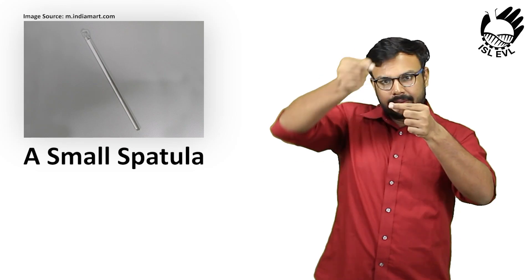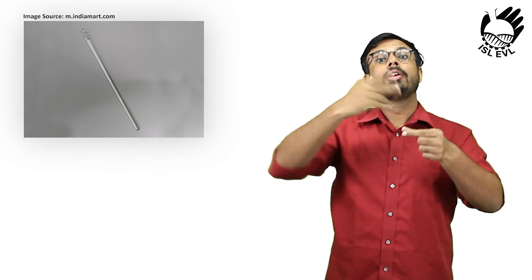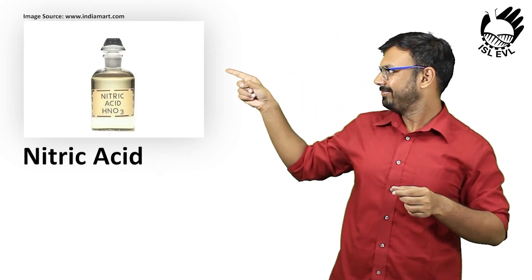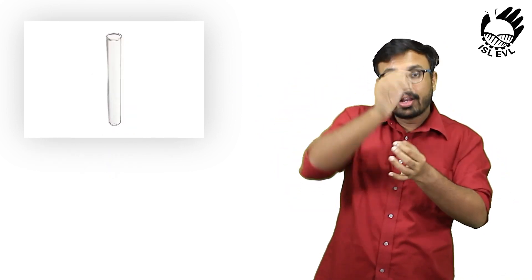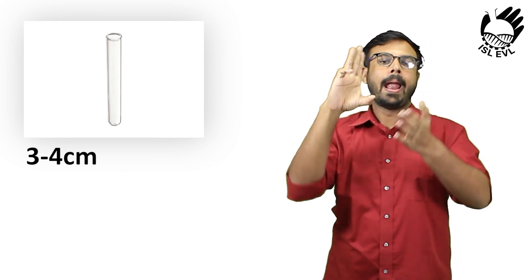Put a small spatula measure of the samples to be tested into a clean test tube. Add diluted nitric acid to a depth of about 3 to 4 cm.